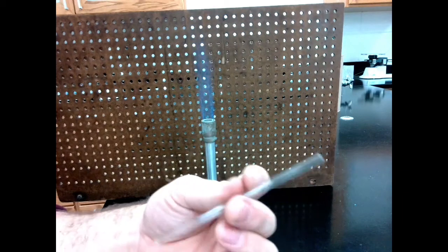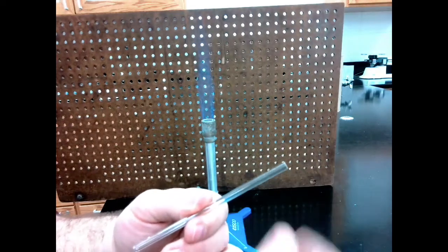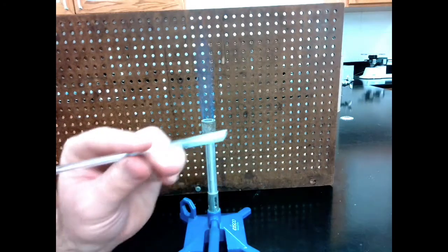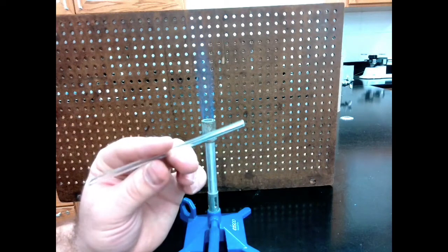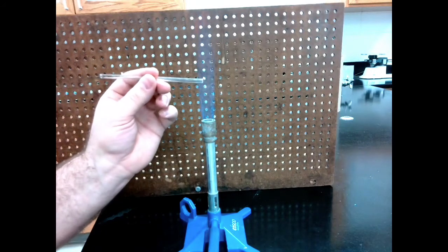So next I need to melt the other side as well to get that nice and smooth. And because this is long enough, I can hold it here. But this is still going to be really hot up here. So I'm going to be careful not to touch it on the hot part, otherwise I would burn my hand. You should be waiting for it to cool down.